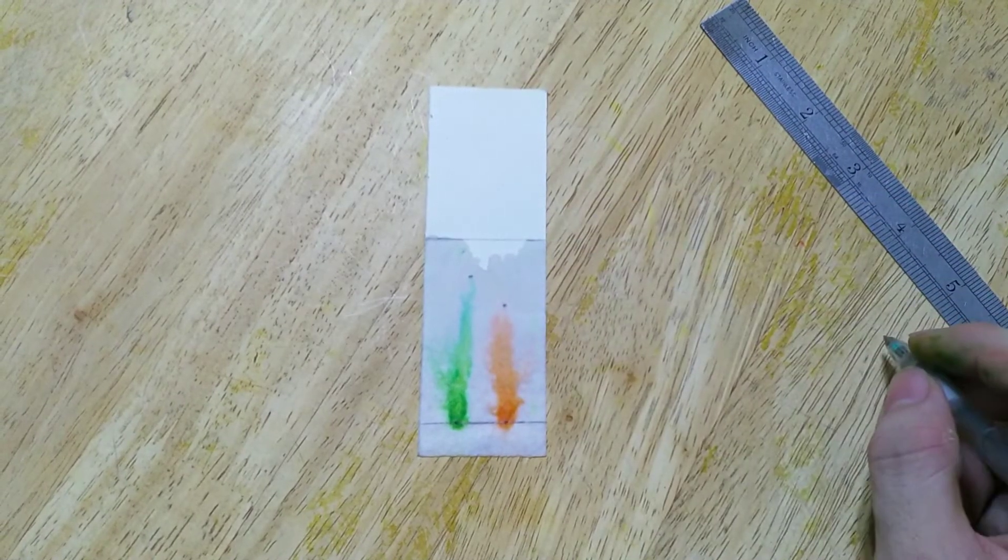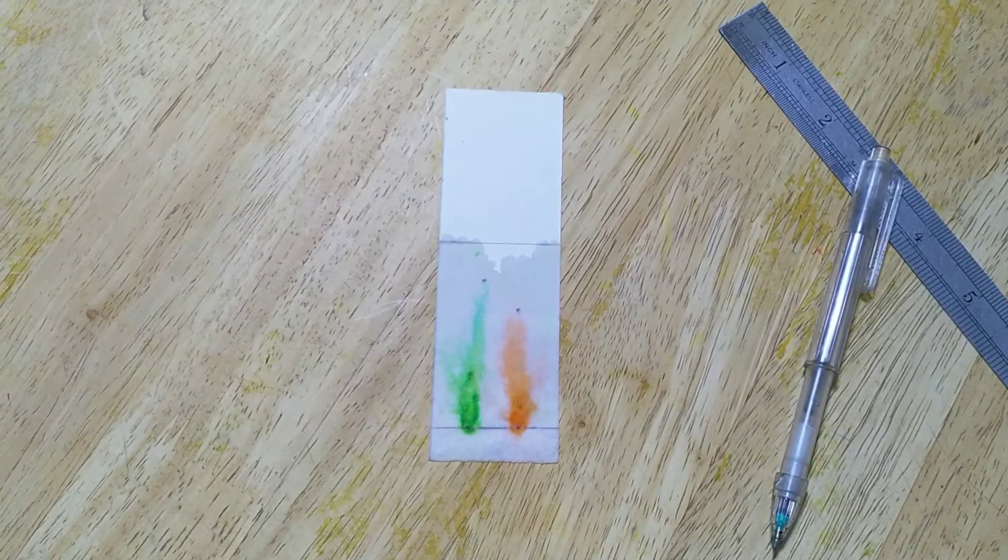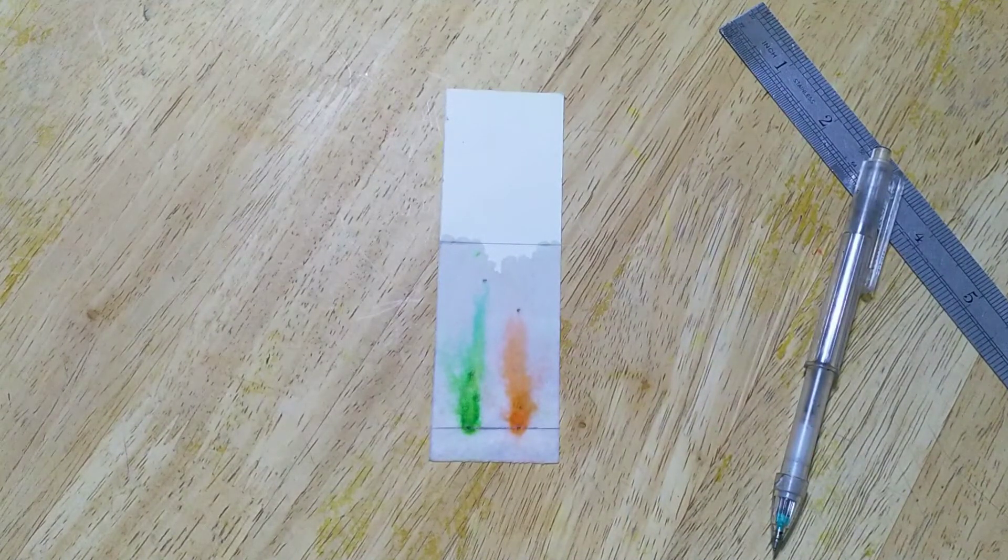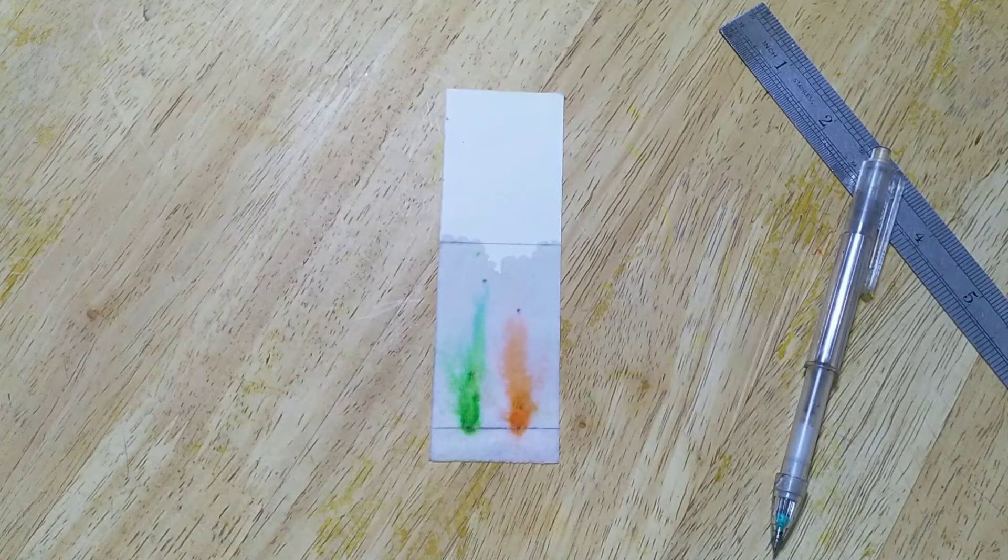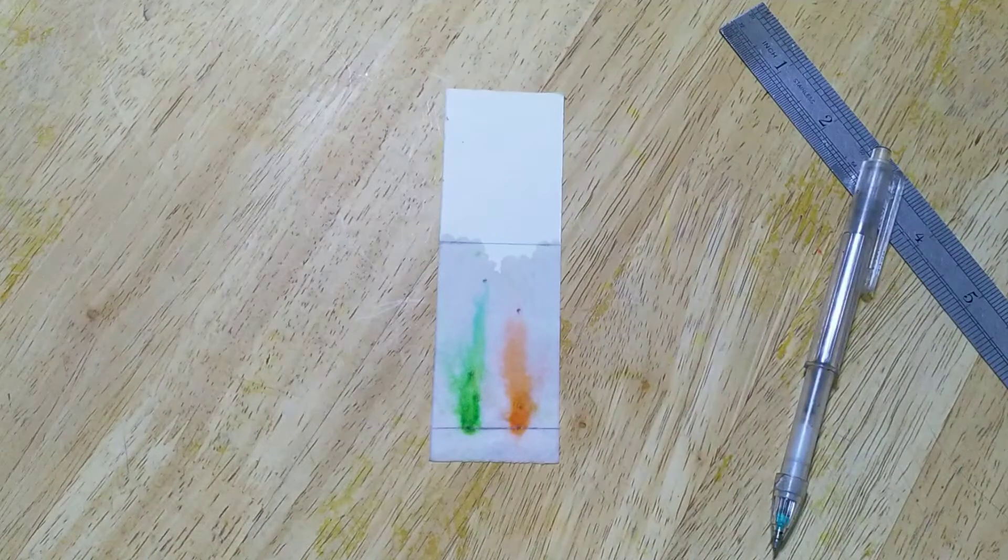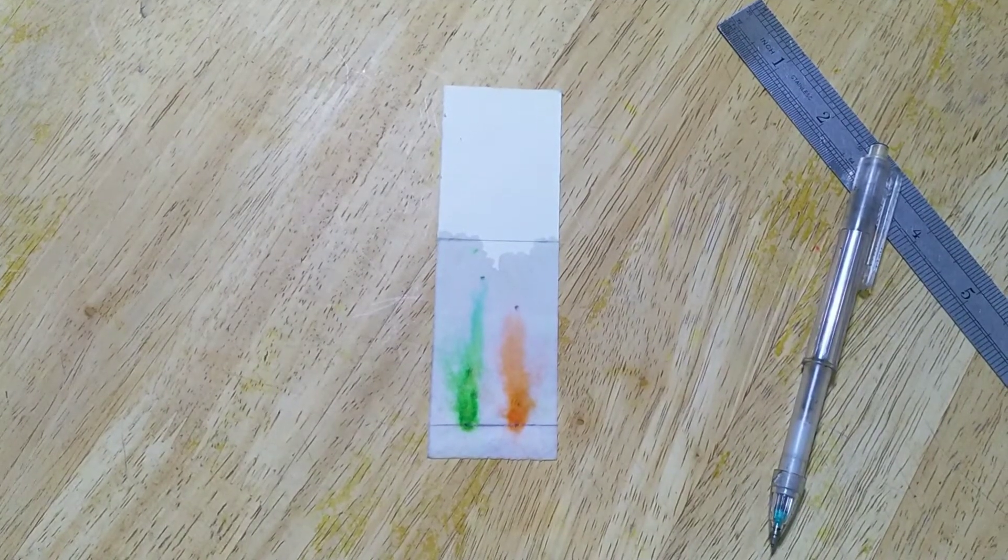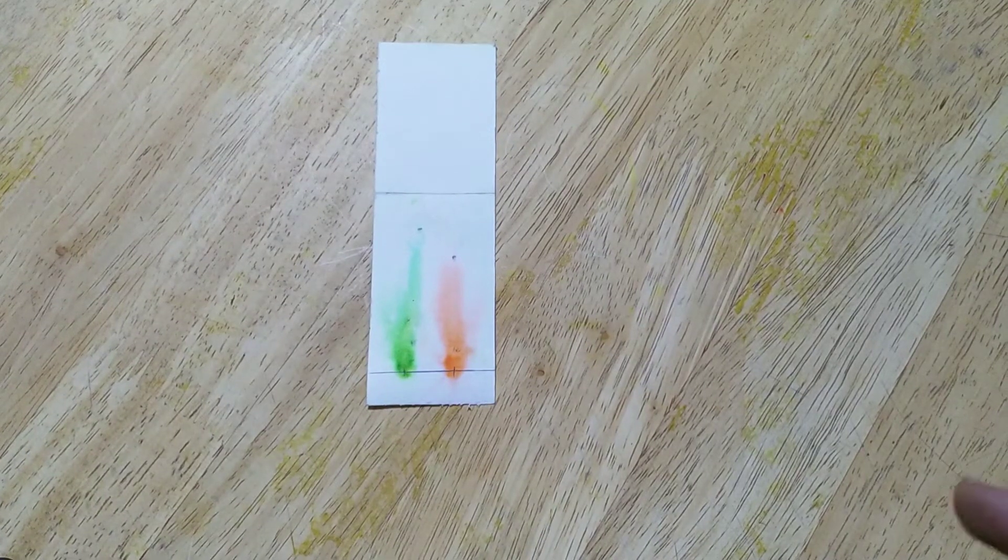Then we let the TLC plate completely dry and then we can measure the range of the color observed and the distance traveled from the origin, then we continue by calculate the RF value. So now we wait for the TLC plate to dry up. After the TLC plate is completely dry, I can see more clearly all the spots.